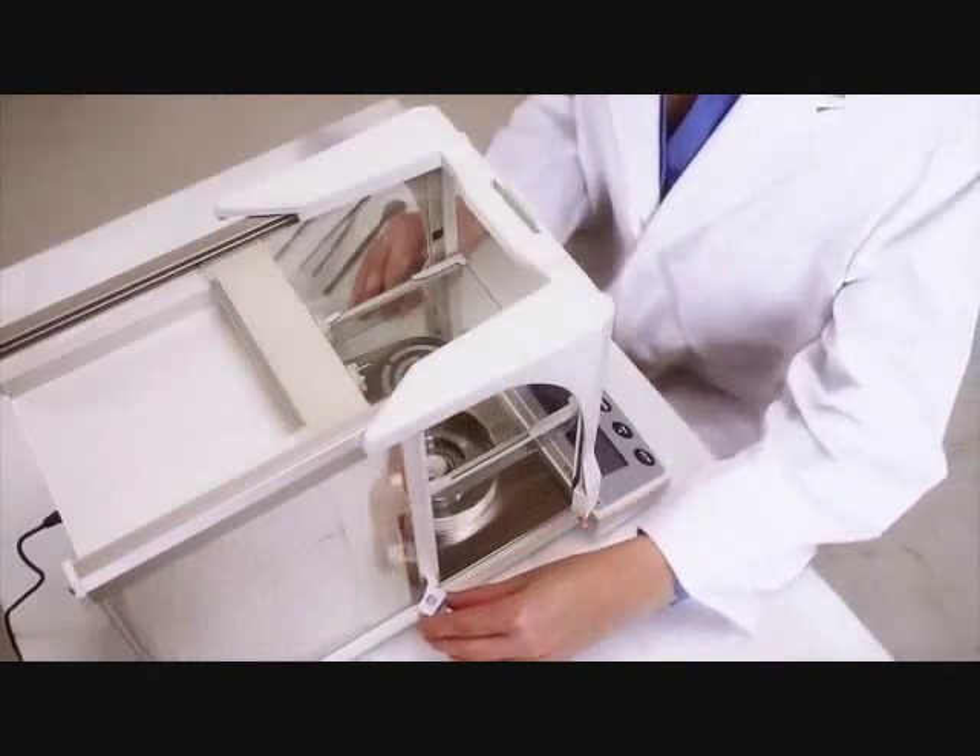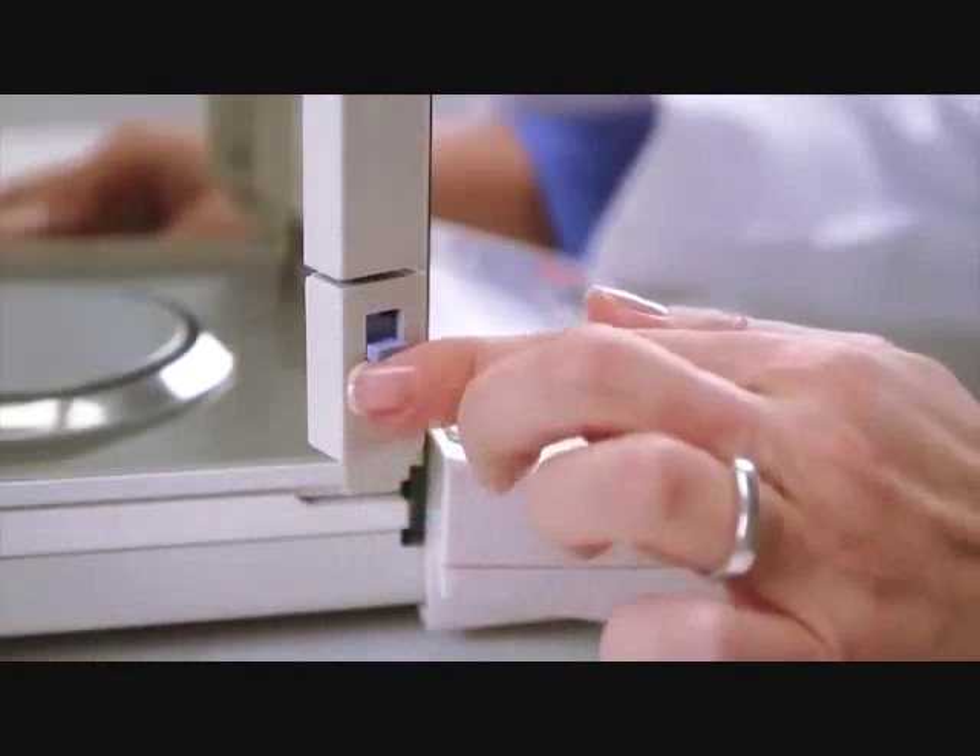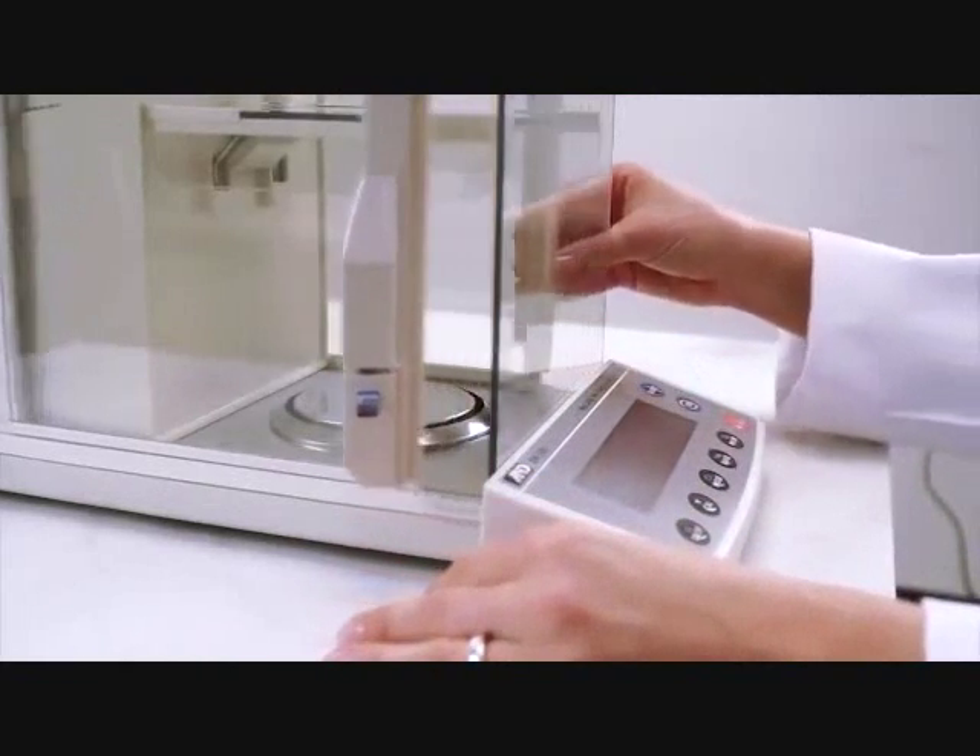Interlocking doors make weighing more efficient because either door can be opened by the opposite hand, or both doors with one hand.